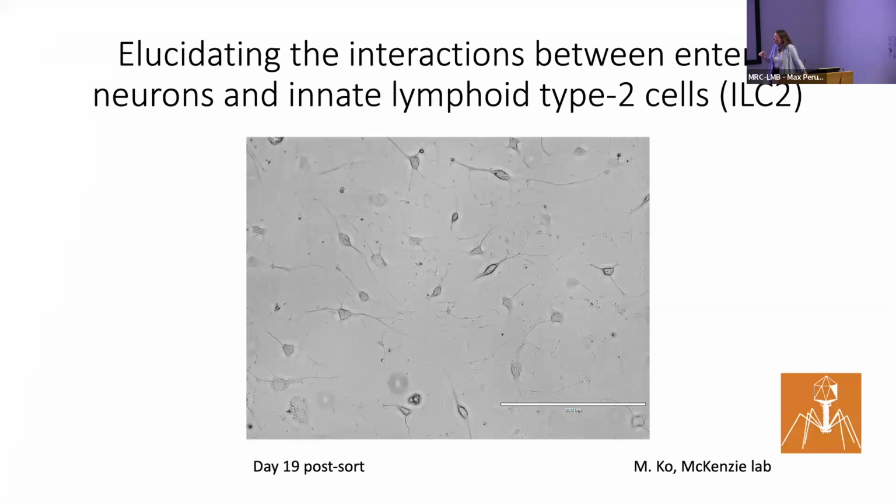And this is a beautiful picture of them growing up, day 19 post-sort. So it's very happy to see that. I love to see happy cells post-sort. It's one of the things that we strive for.